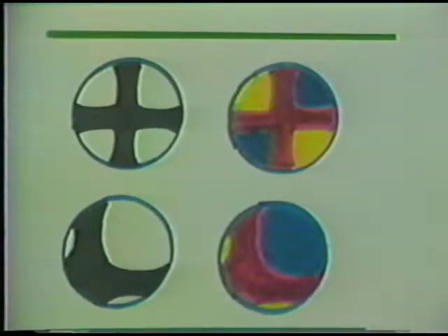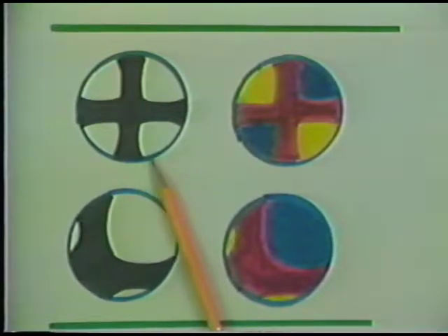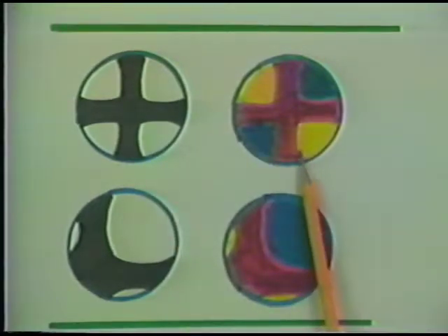For example, here is sign determination for the common kinds of uniaxial figures, the optic axis figures, for example, the centered optic axis figure. And this is the indication of what the centered optic axis figure would look like on, let's say, a grain of the mineral quartz. First of all, in the straight cross-polarized light, and second, with the gypsum plate.